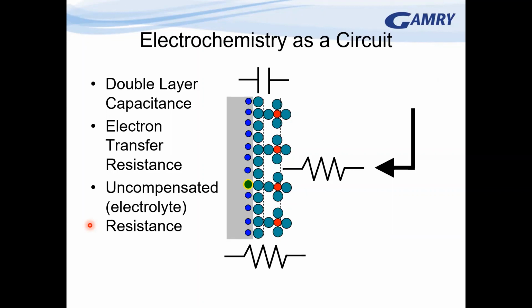There's a question here, if there is a way to measure corrosion rate involving a galvanic couple. I mean, you can do the biased ZRA experiment. I believe there's a patent on that, maybe, or at least some papers. The problem with that type of experiment is the current may be dominated by one electrode over the other. So you're just sort of getting the corrosion rate of the couple. Okay.